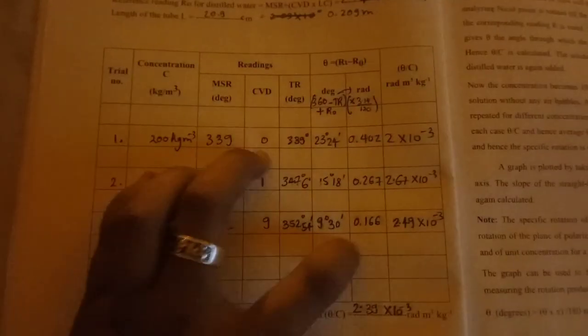When you find it in degrees, you can convert it to radians by multiplying the degree value by pi by 180. When you have degrees and minutes, you should convert it to seconds and then find it in radians.